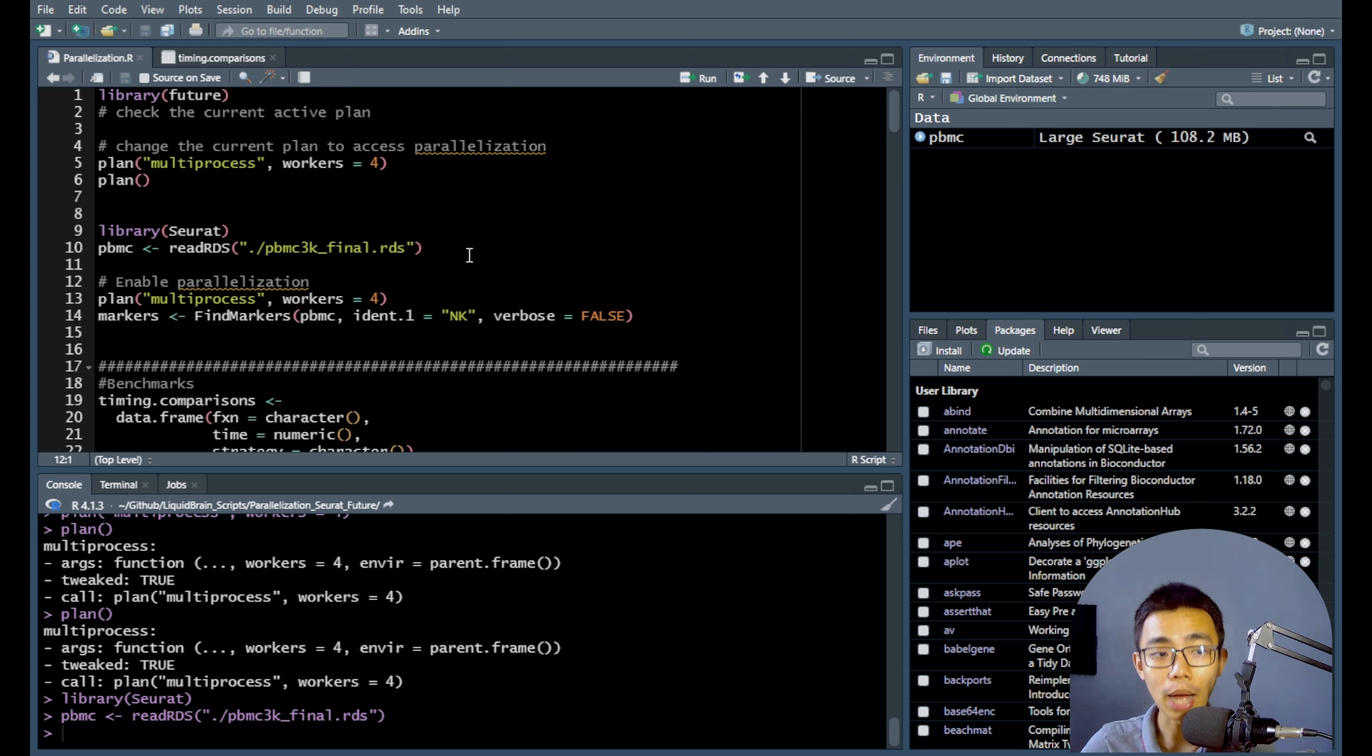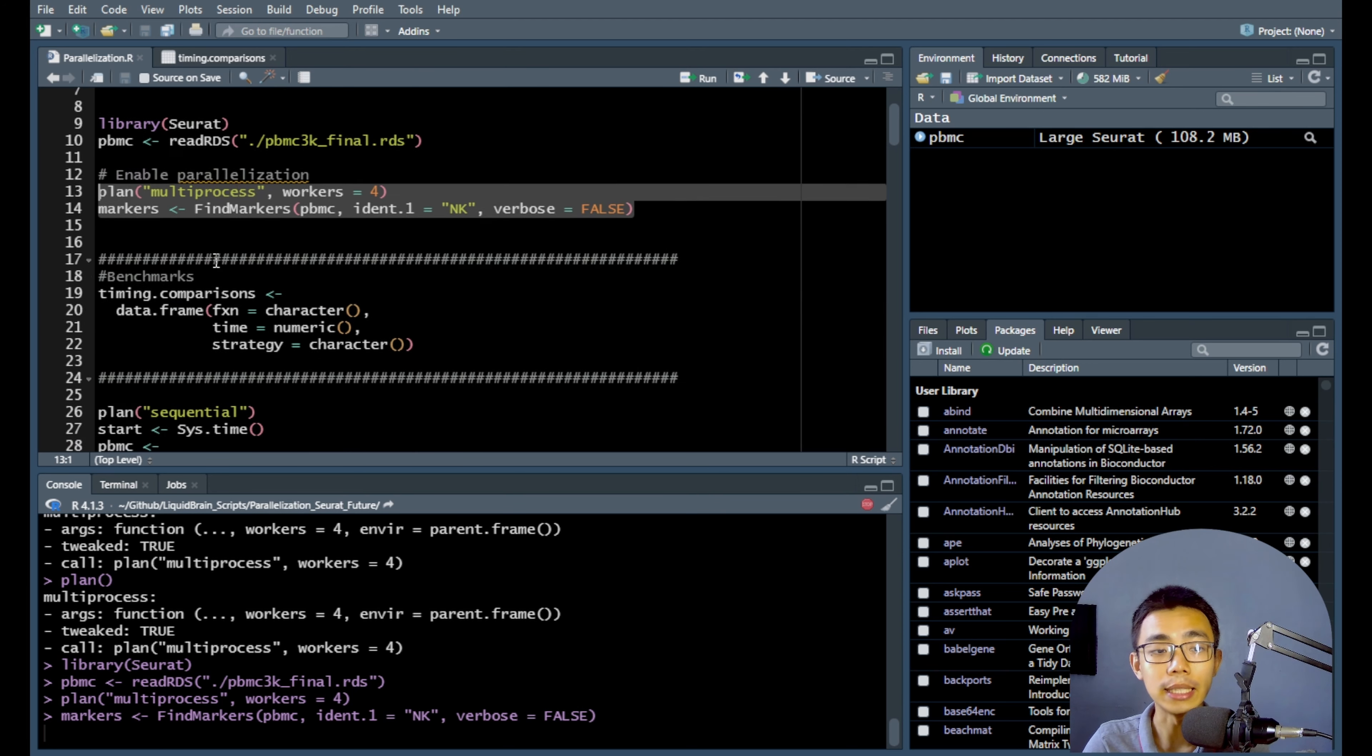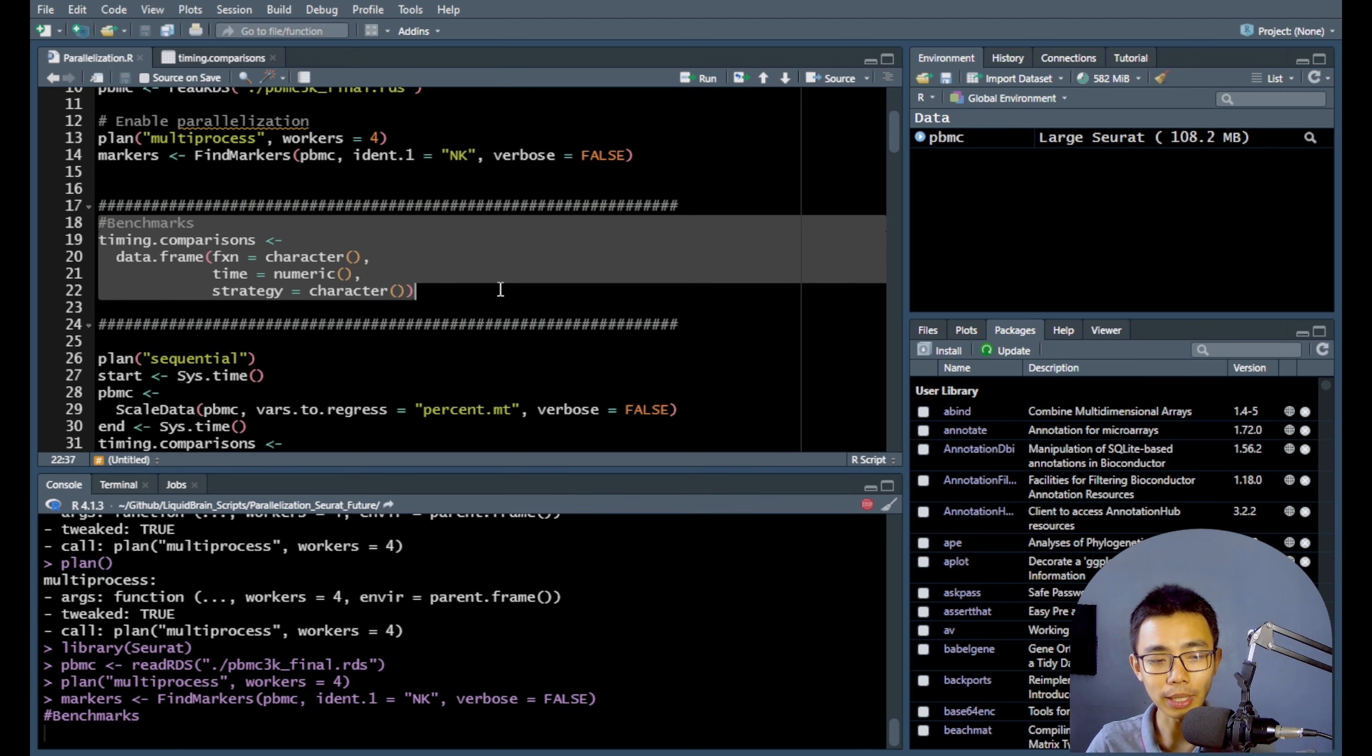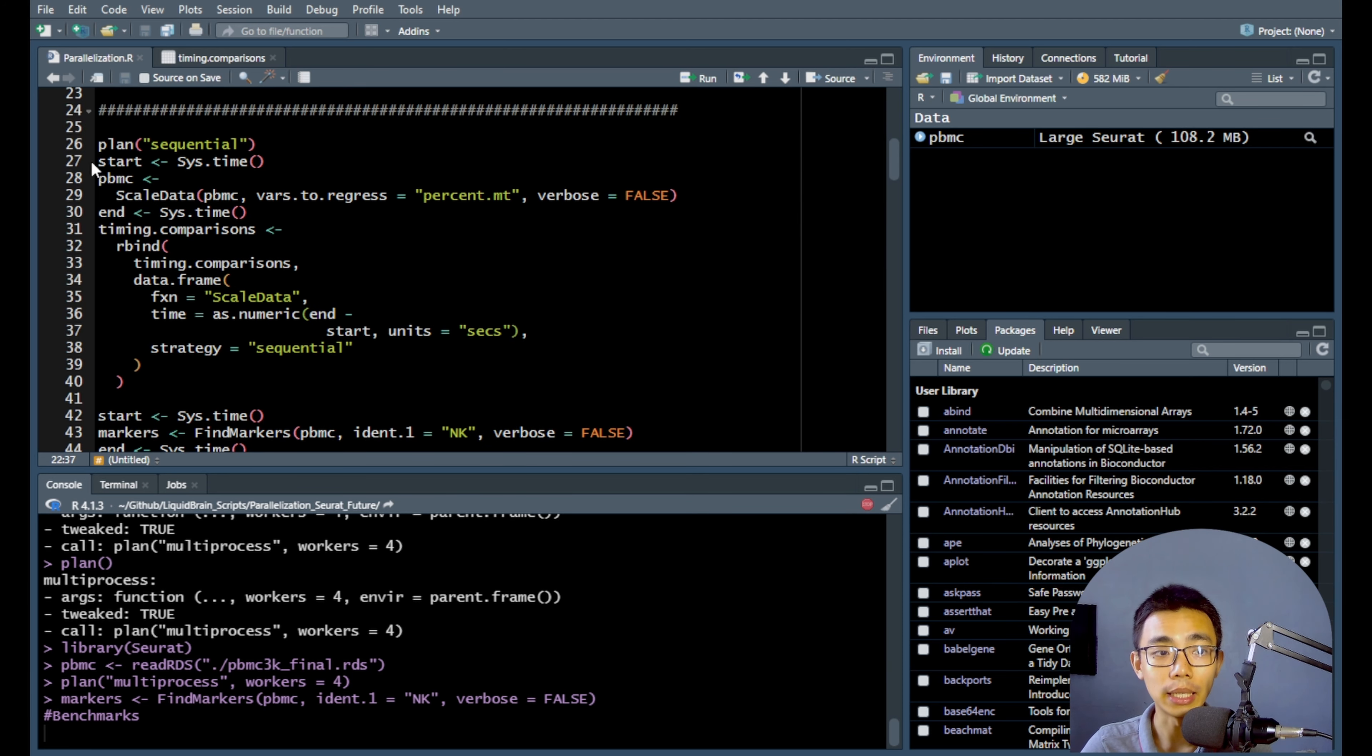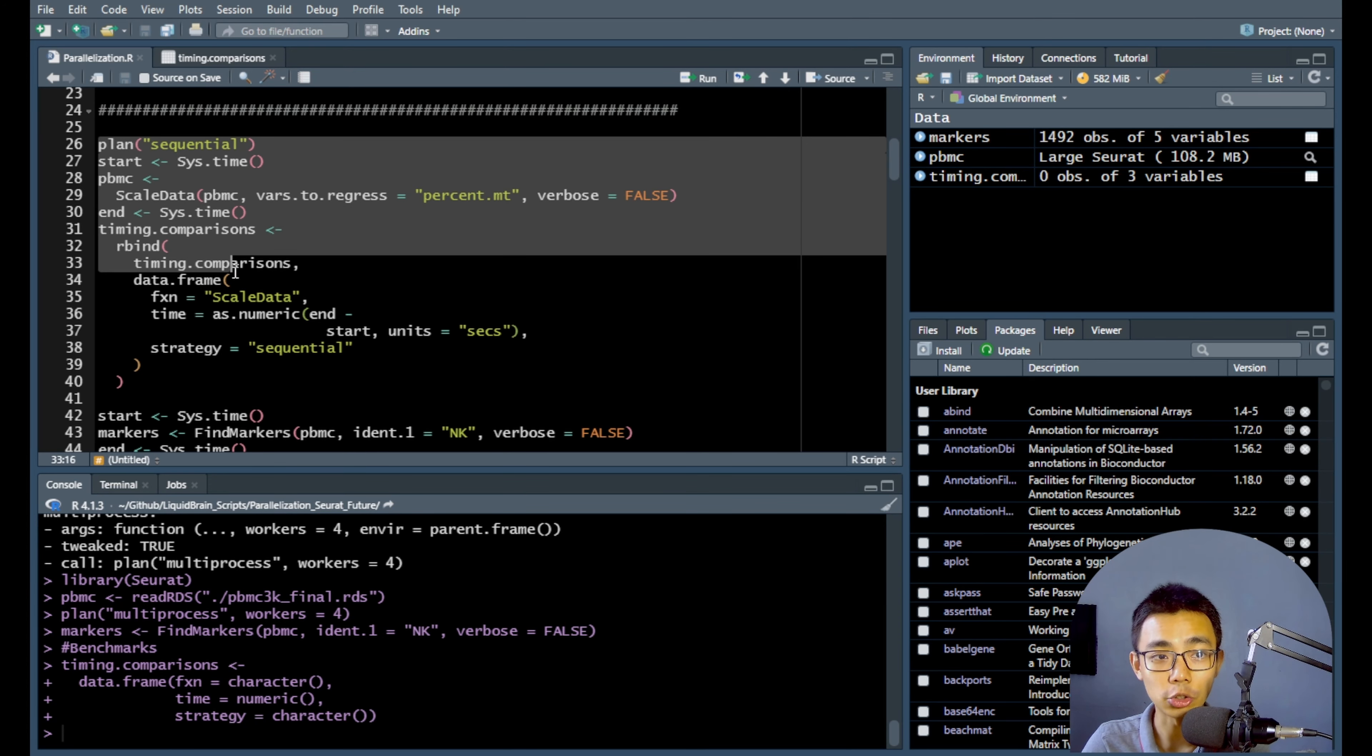And how do you enable parallelization? It's just run the plans before the find markers and that will actually just enable the multi-threading process. So that's pretty easy. How it works for the benchmark is, of course, we need to set up a way to time it. So what the code is doing here is to create a timing comparison data frame so that we can actually record the start and end of a calculation so that we can actually minus them off to find the time difference between them.